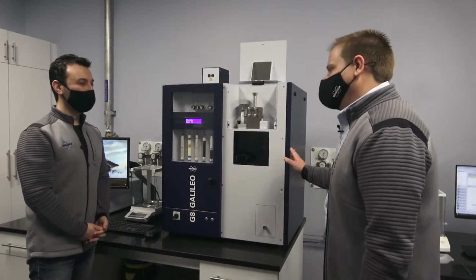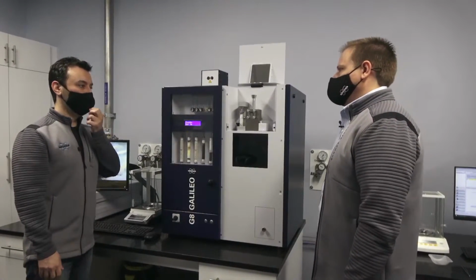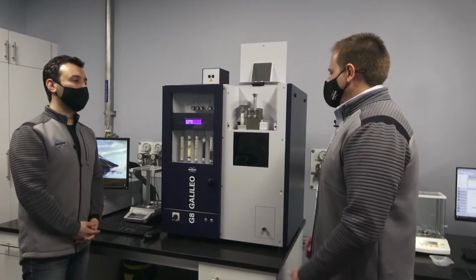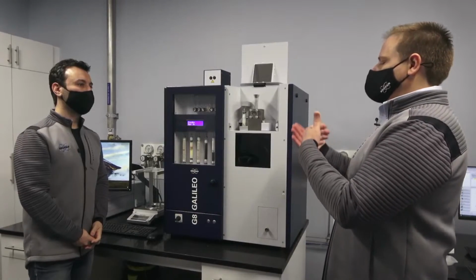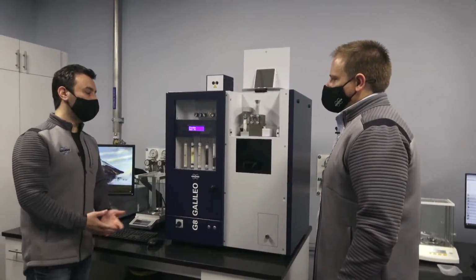Is there any other application? Is this also used in the steel industry? Yes, it is. Almost every steel manufacturer has this kind of instrument, fusion analyzers. Okay. And now there's this topic I've heard of before. There's total hydrogen, and then there's diffusible hydrogen, especially when you're welding. Right? Yes, diffusible hydrogen, we can also do that.